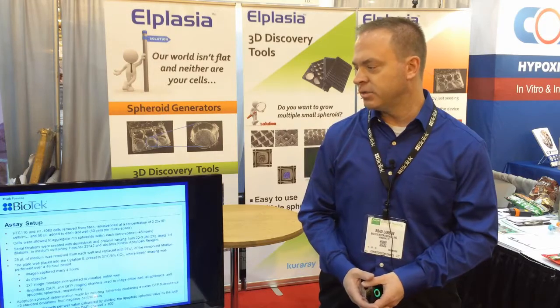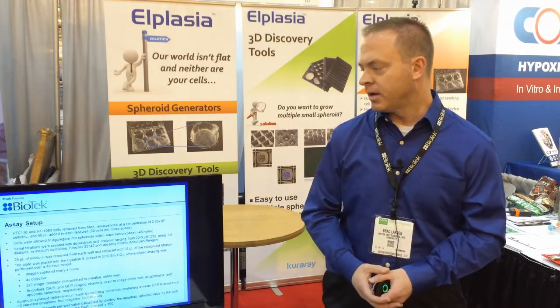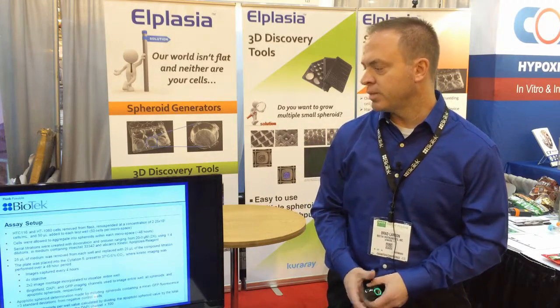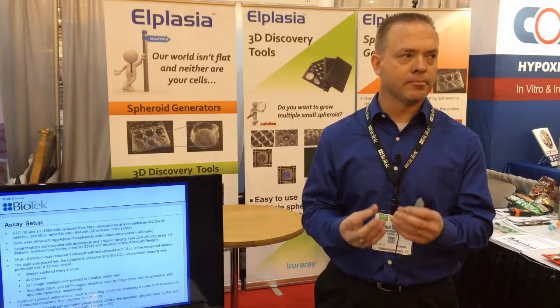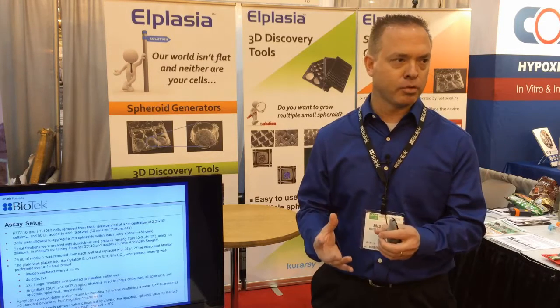We used two different cell models for the project: HCT116, which is a colorectal cancer cell model, and HT-1080s, which is a cancer fibroblast cell model. The cells were resuspended and then plated into the 384-well microplates at a volume of 50 microliters. With the concentration we were using, approximately 50 cells would settle into each of the micropores in each well, and there are approximately 225 micropores per well.